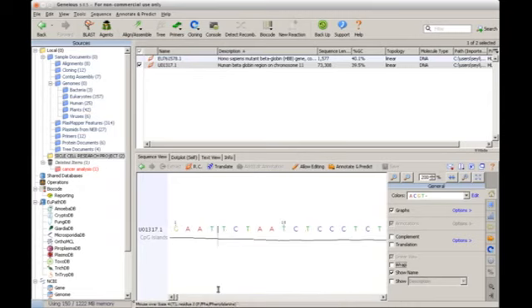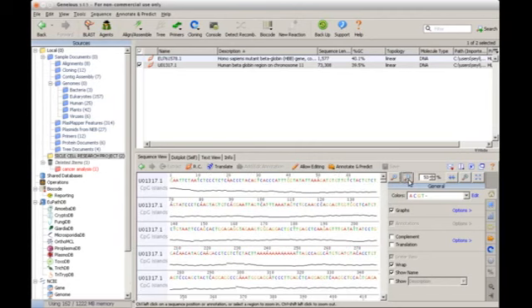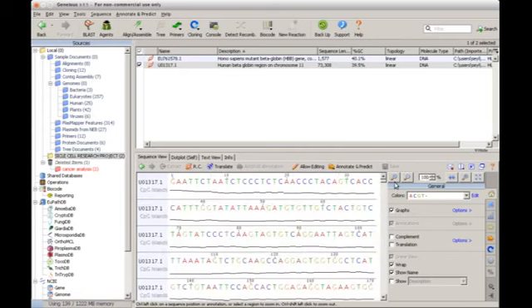Now there's a significance to the graph. Let's wrap it again. This graph is telling you a particular message. Now we have a total of 4 kinds of nucleotide bases in every nucleotide sequence.